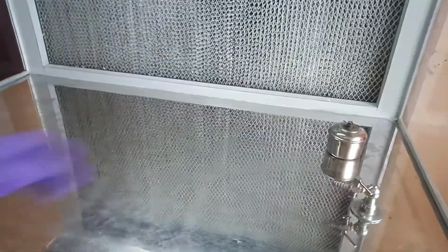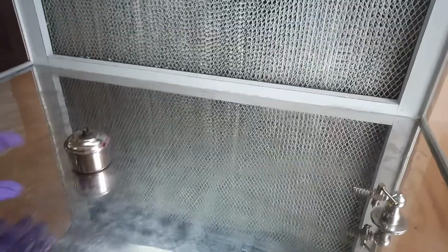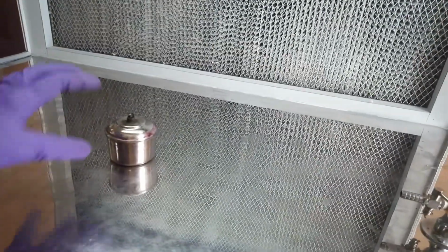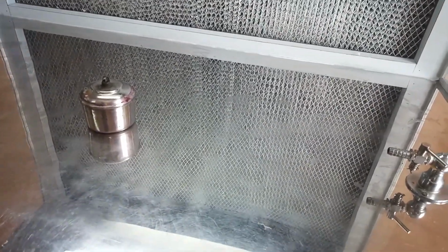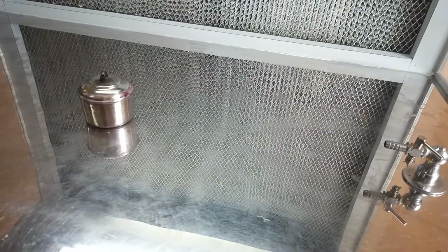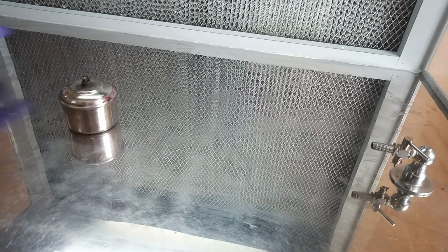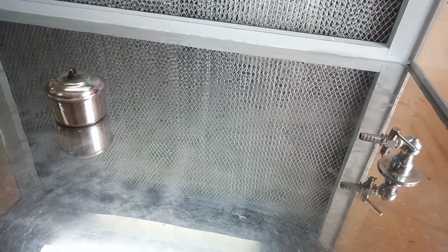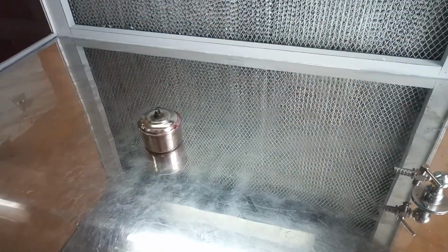Then we light the Bunsen burner, because whenever we work with microorganisms we should do it near a flame, near fire, so that nothing is contaminated and we get pure isolated colonies. Before starting with our isolation and inoculation, we have to clean the surface with the help of alcohol, and after that we can carry out our function. So that is all about the functioning of laminar airflow.